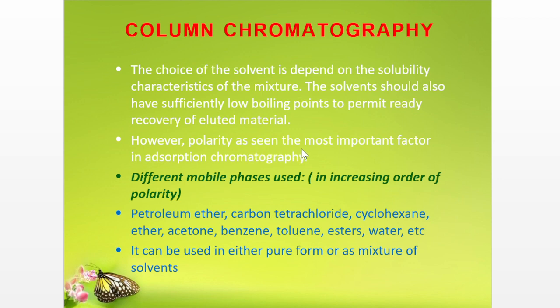However, polarity is seen as the most important factor in adsorption chromatography. Different mobile phases are used in increasing order of polarity.